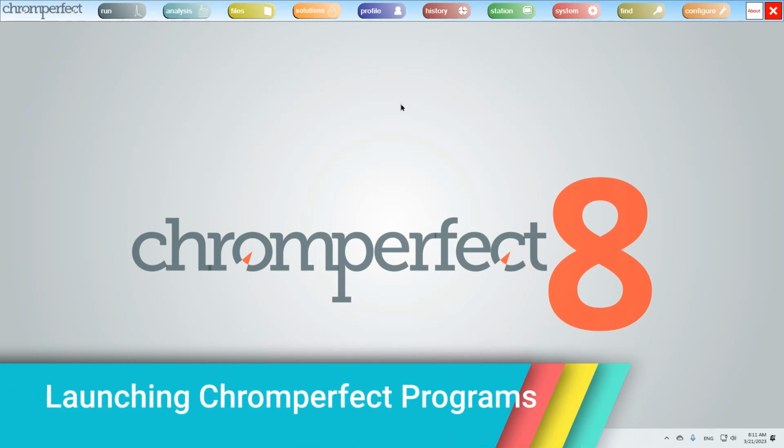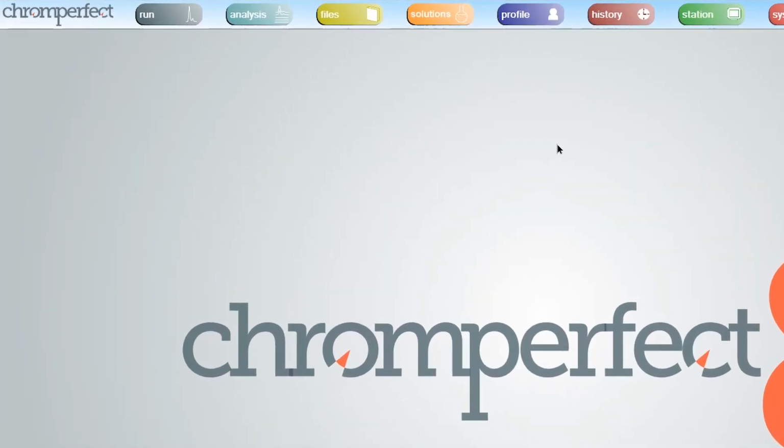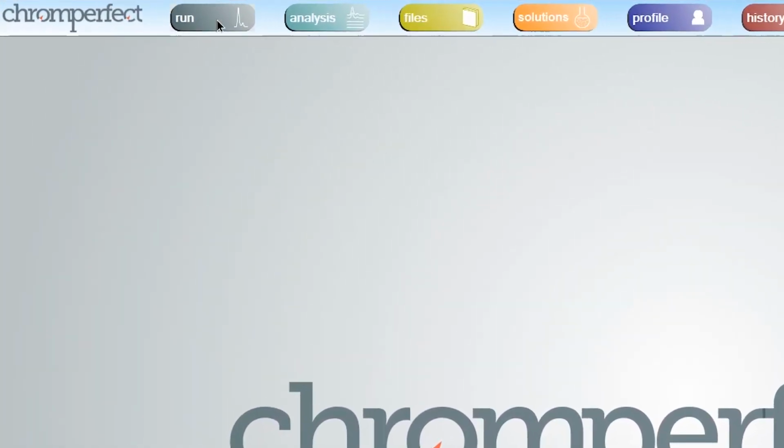Launching other Chromperfect programs. The primary purpose of the main menu program is to launch the other Chromperfect programs. There are 10 of these programs, and a button on the menu for each one. Run, which was previously called Acquisition, is a program that communicates with instruments and creates new raw files. The analysis program integrates raw files, generates reports and plots, and creates bound files.